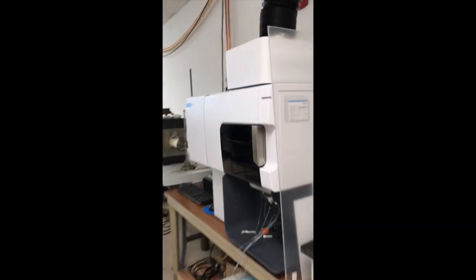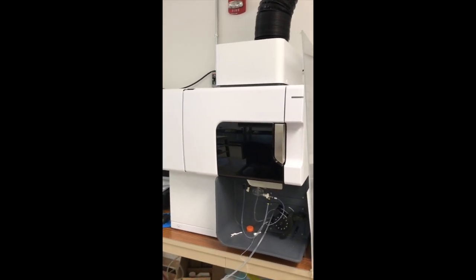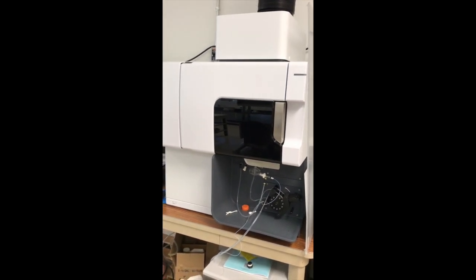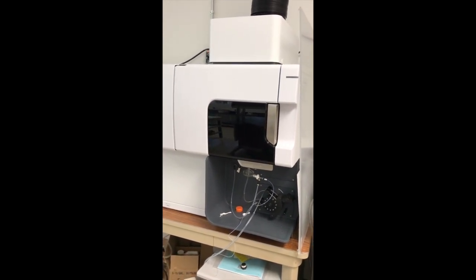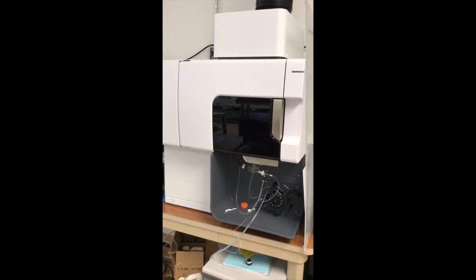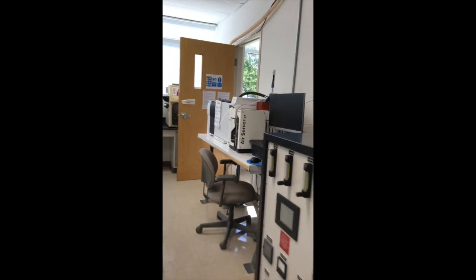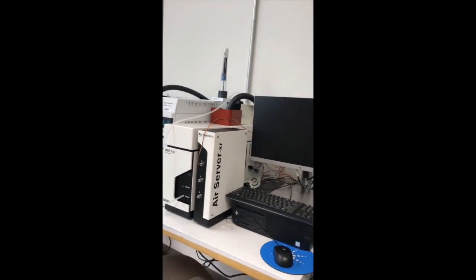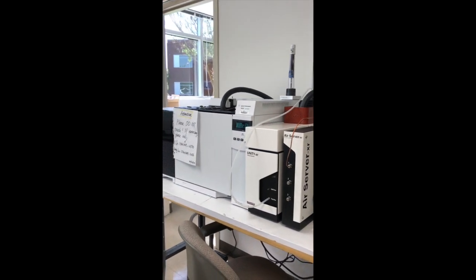And this side, I'll show you first. This white box is called a mass spectrometer. Basically, when you deal with materials, what kind of ingredient do you have? How much do you have? So this mass spectrometer can tell you at part per million level what you have. And also, it's mainly for measuring solid material compositions. If we need to measure gas compositions, such as different kinds of gas, like carbon monoxide, hydrogen, water vapor, nitrogen, and so on, we use this. We call it chromatography. Basically, it's a GC.